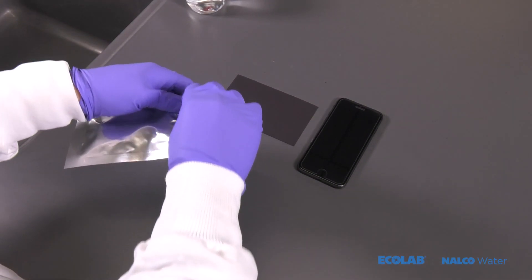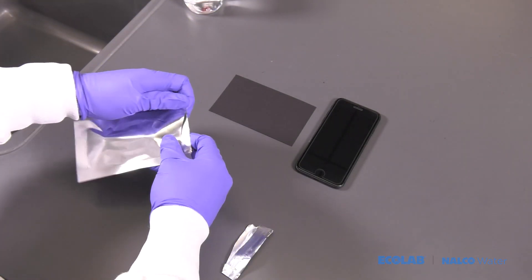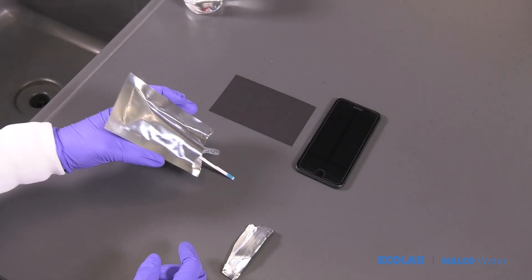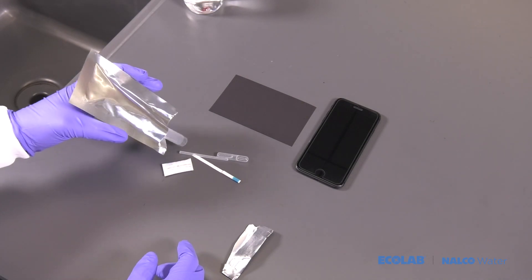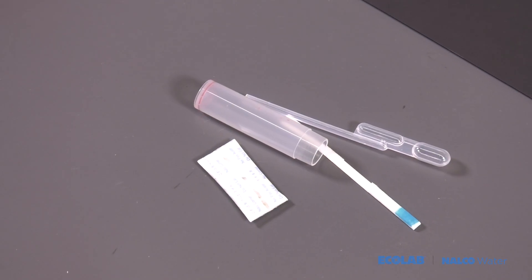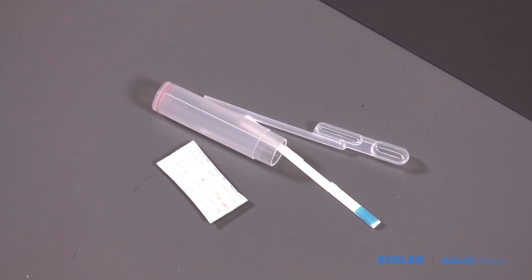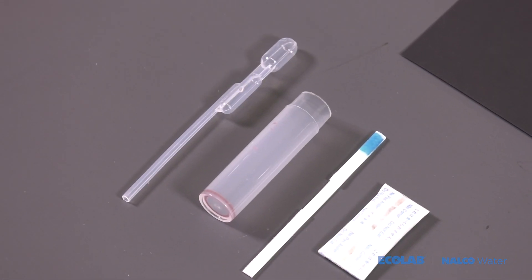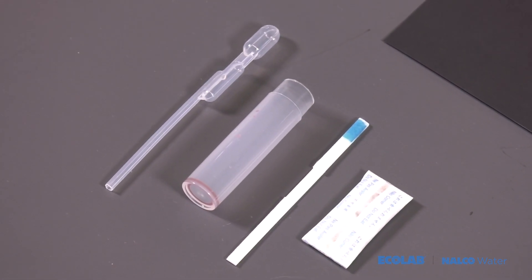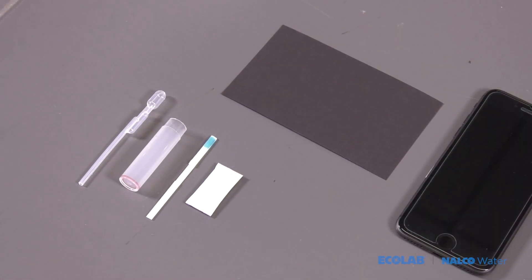Open the foil pouch and remove the contents. Verify all test kit items are available which includes volumetric pipette, one test vial, one test strip, one desiccant, one backdrop.